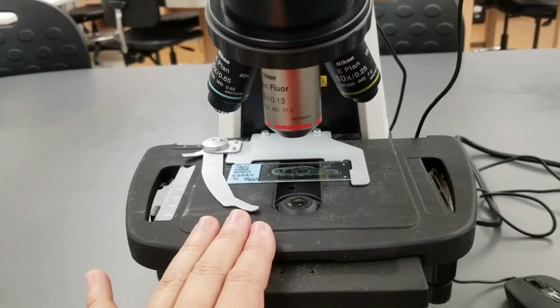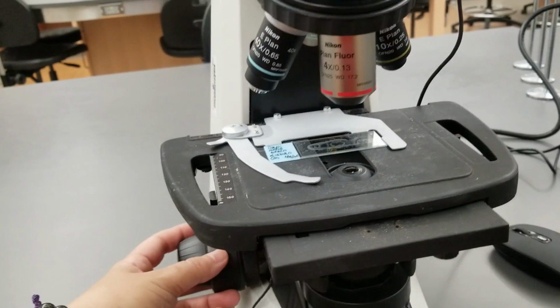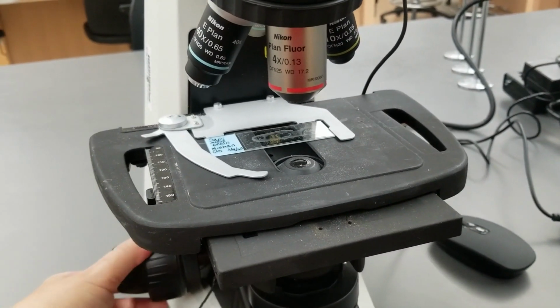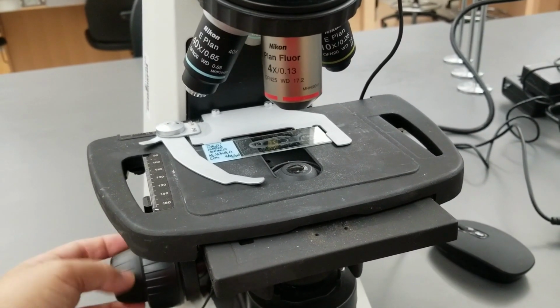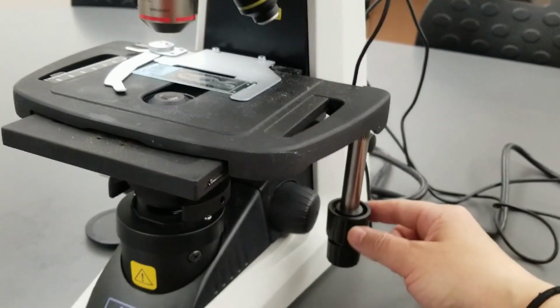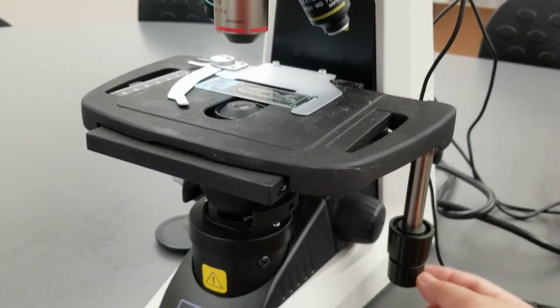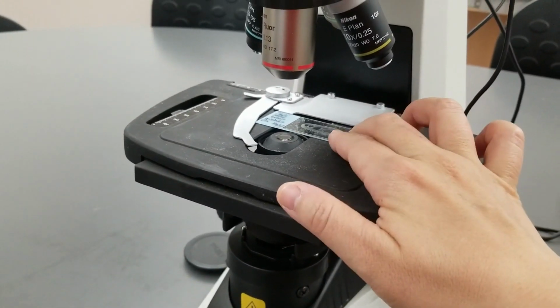When you need to move the slides up and down, back and forth, and left and right, there are knobs that control the stage. This big knob here moves the stage up and down. So move the stage up and move that down. And there's this fine adjustment. You won't see much; it moves up and down a very small amount. If you need to move the stage back and forward, there's a knob on this side. The upper part will move the stage forward and backward, and the knob underneath that will move the stage left and right. That way you don't have to use your hand to move your slide.